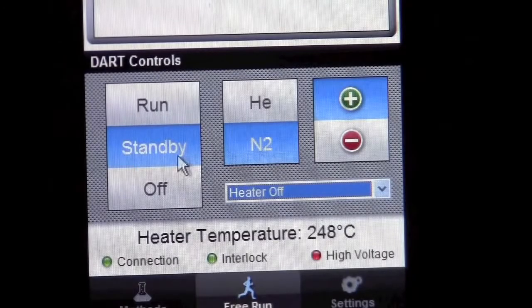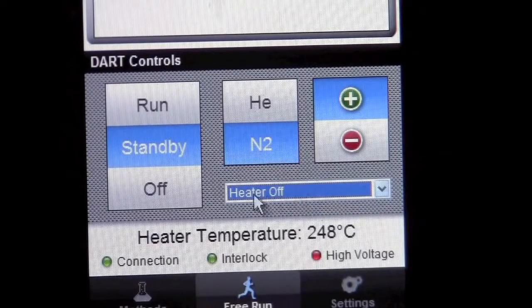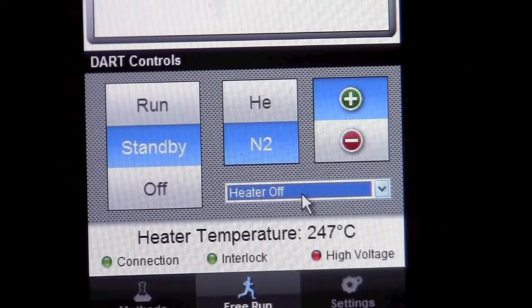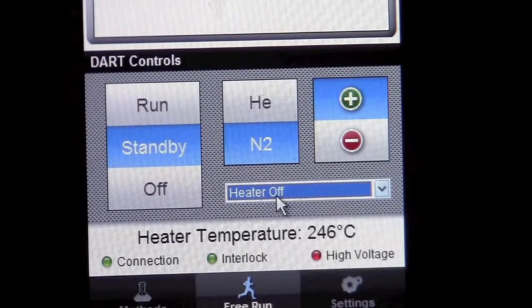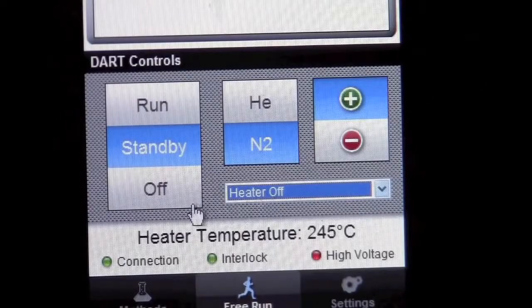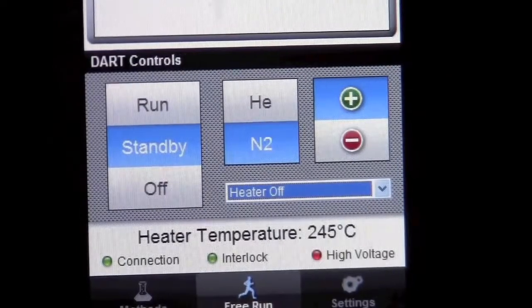In this case, we'll leave it on nitrogen until the source has cooled down and then we're finished.